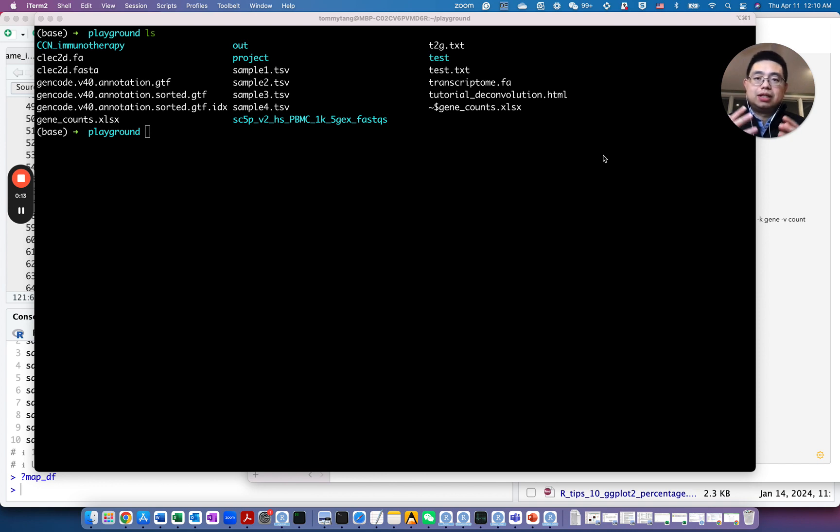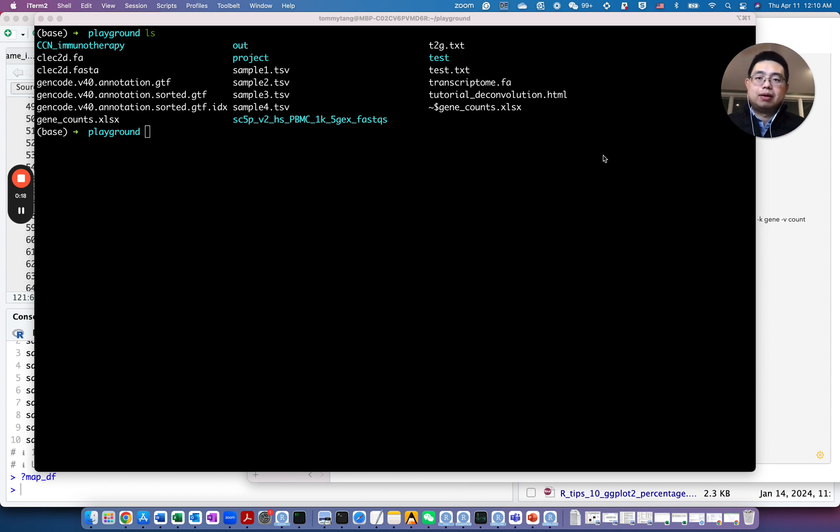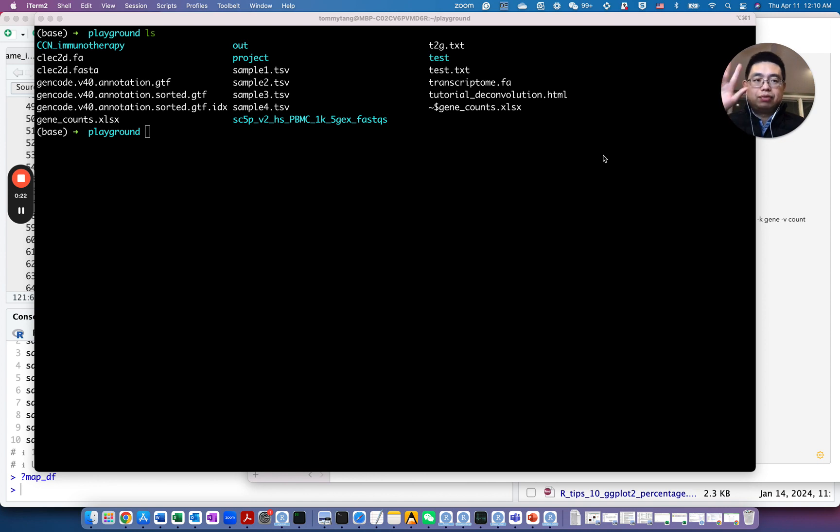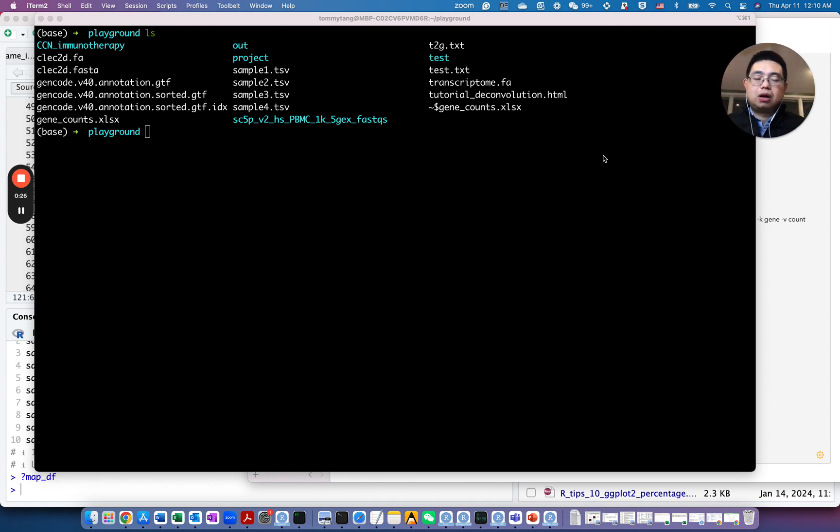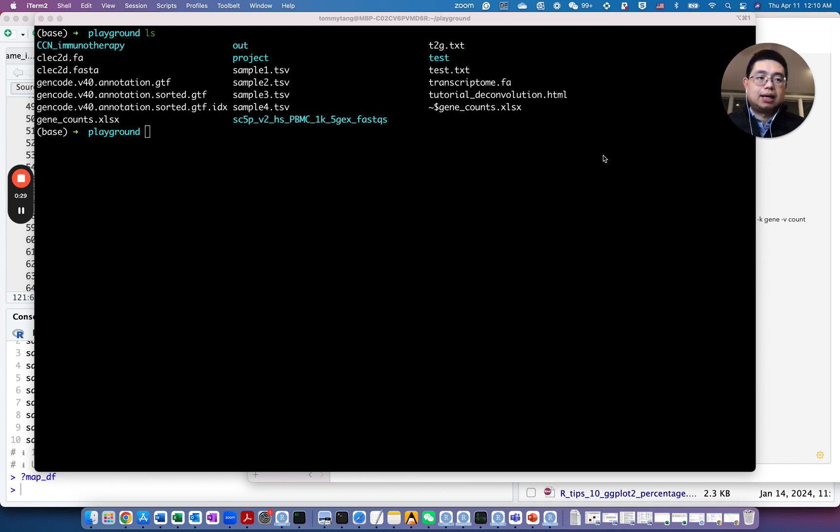So this is very common actually in sequencing data. For example, you get the counts per sample individually. So you have each sample with two columns, the gene column and the counts column, and you want to combine them into a single data matrix. How do you do that?